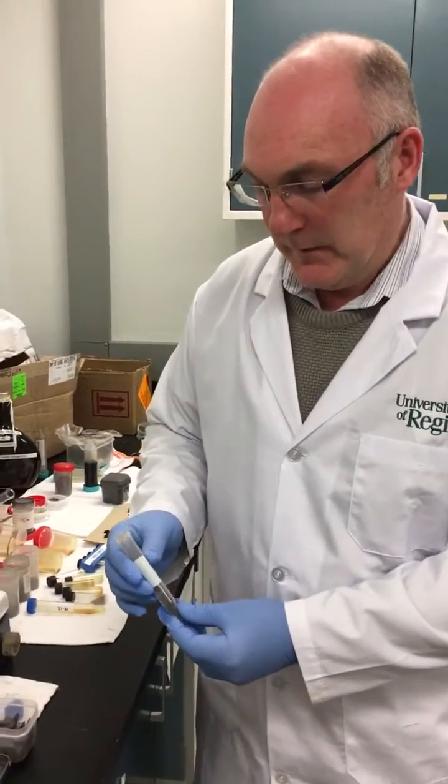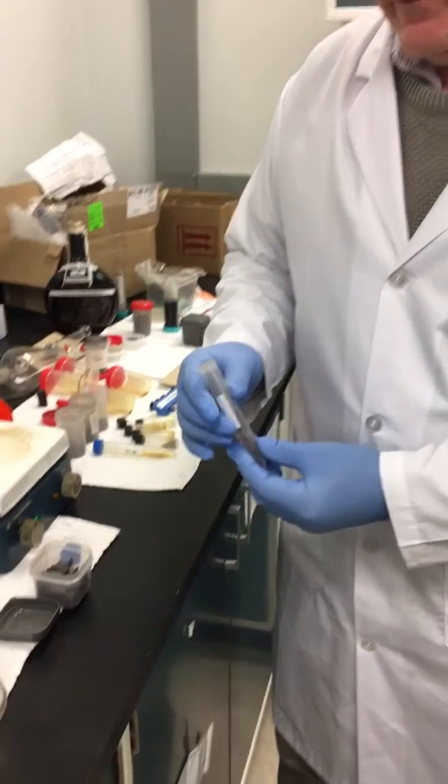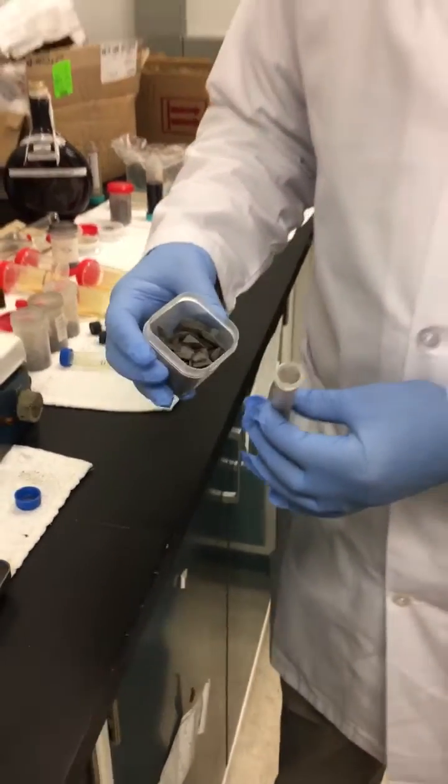The purpose of this second test is to showcase the flexibility of the liquid catalyst. We're now working with solid oil and coal shales from South America.